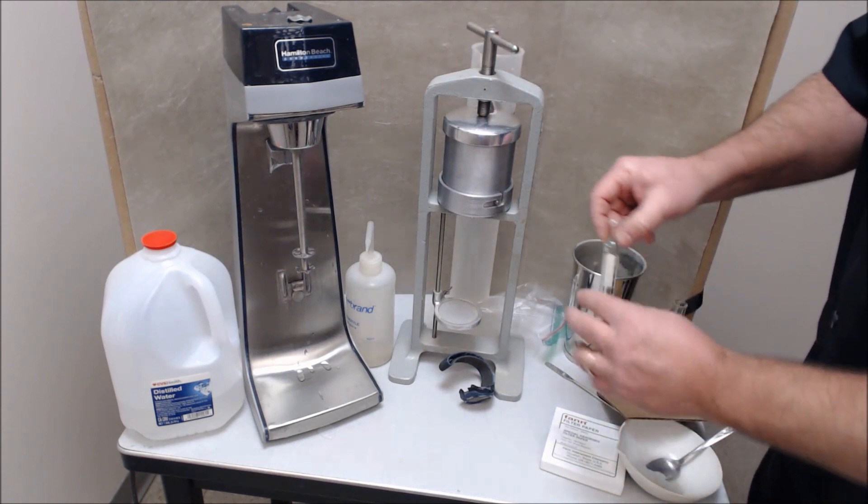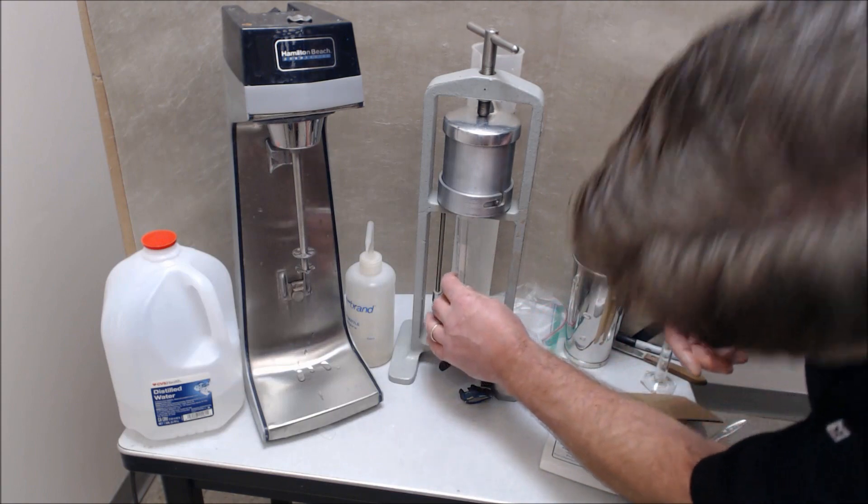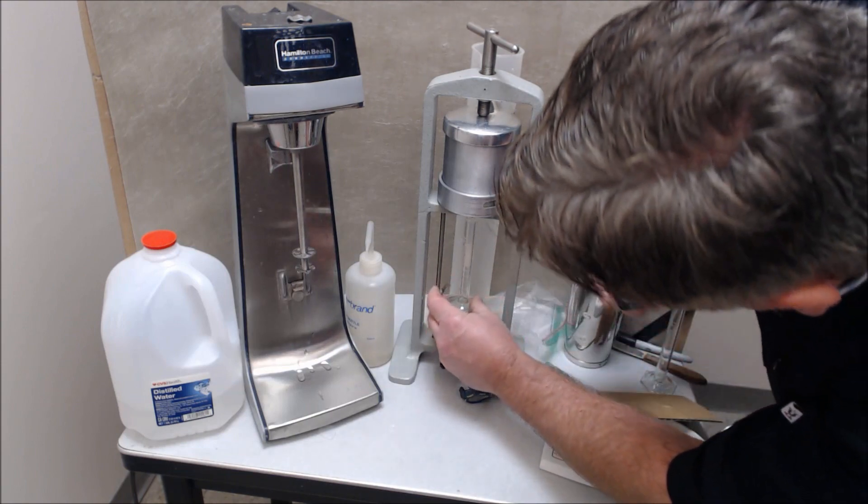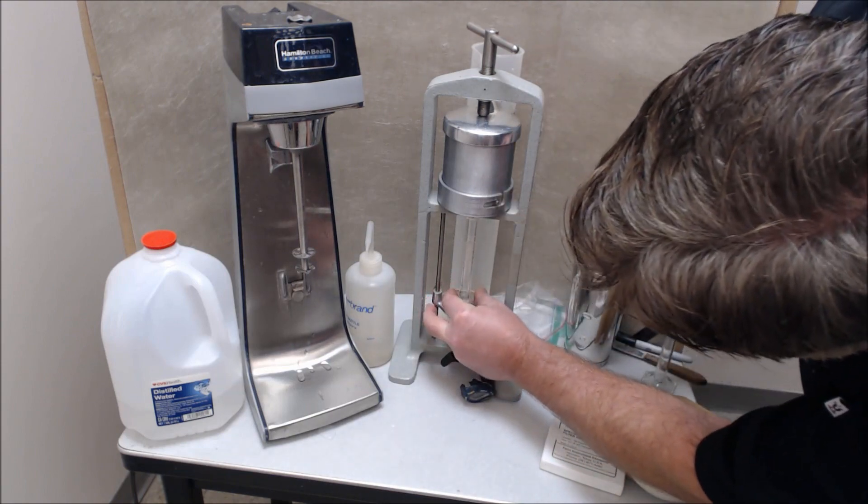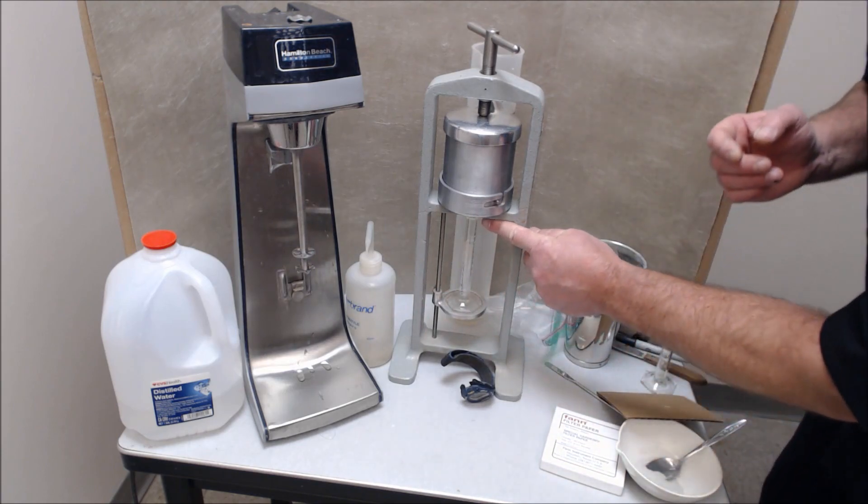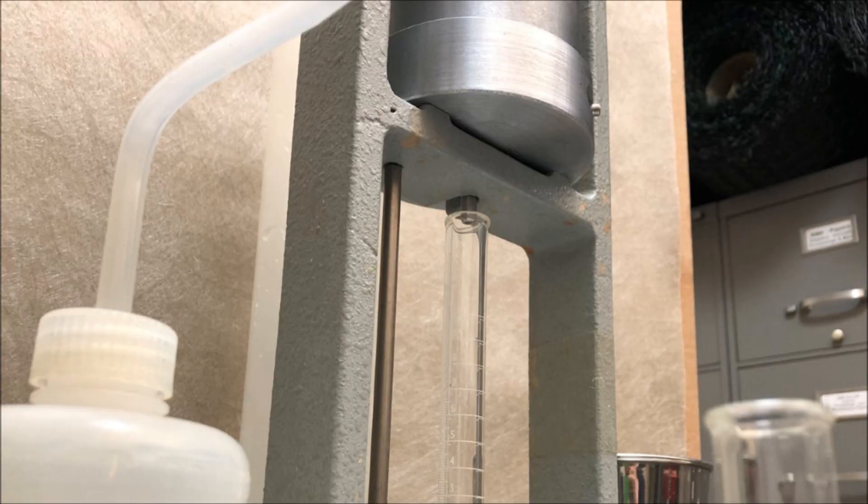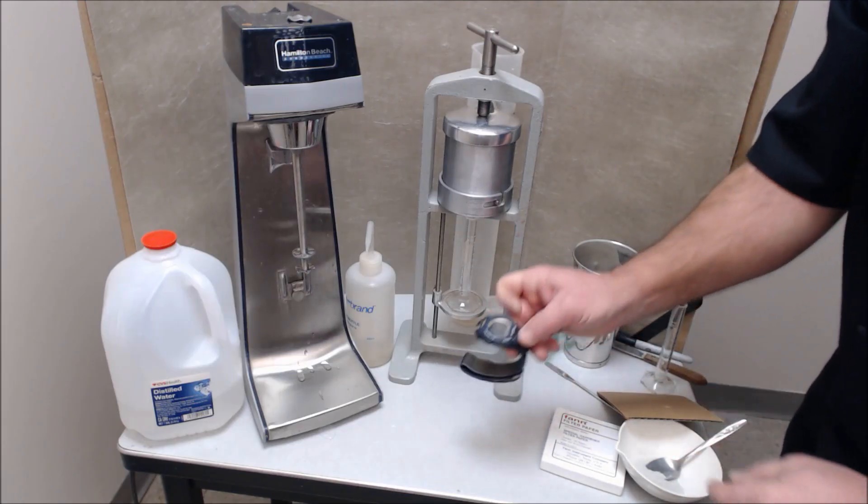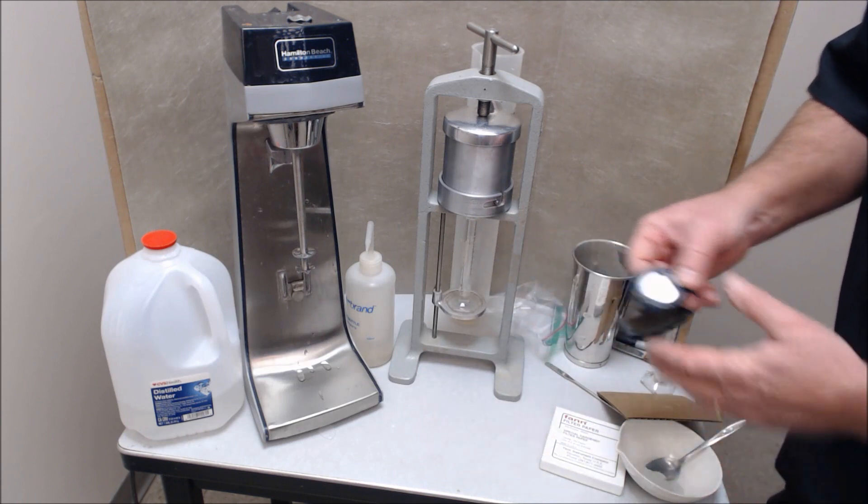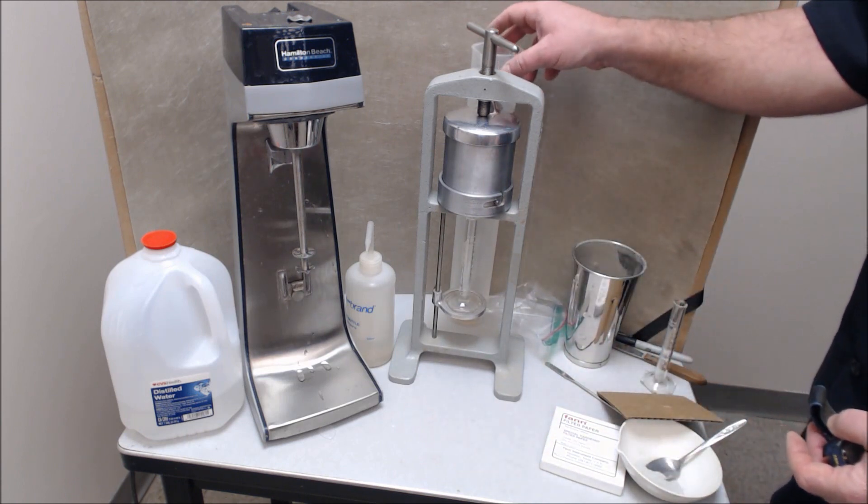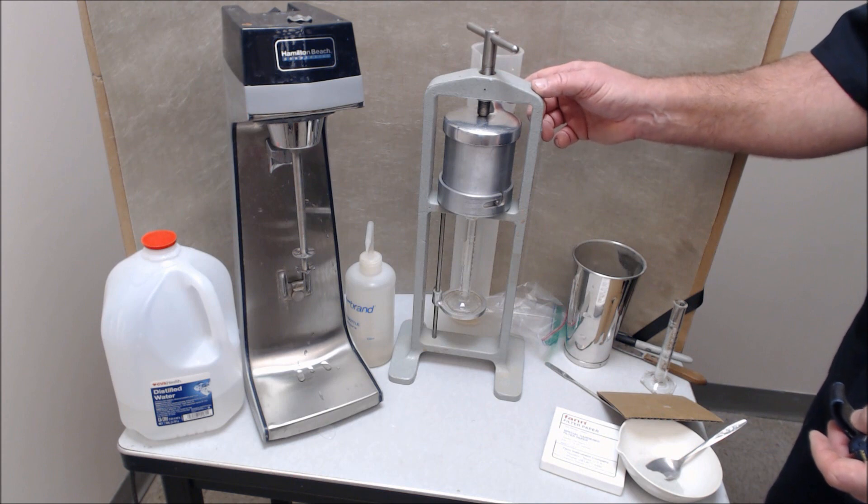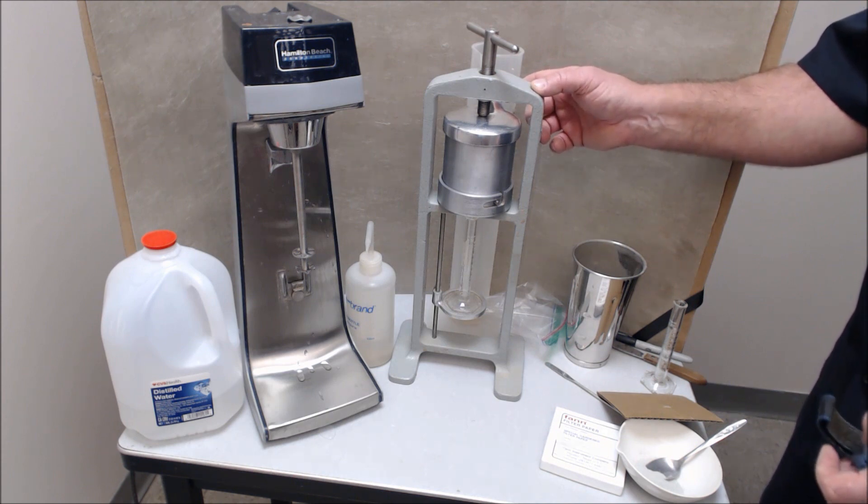You have to assemble it in the right sequence and apply a normal pressure through this screw in the back. You then will take a graduated cylinder and this graduated cylinder will go underneath the press. There's a hole in the base of the press that this fits into. You'll set your timer and introduce a pressure of 100 psi to the back of this filter press.